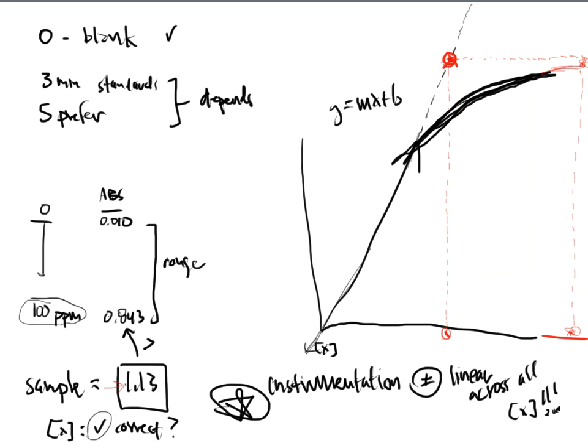So what am I trying to tell you? Well, first, what I'm trying to tell you is that if your sample runs over 1.13, you can't use it. Can't use it. We're going to have to fix it.